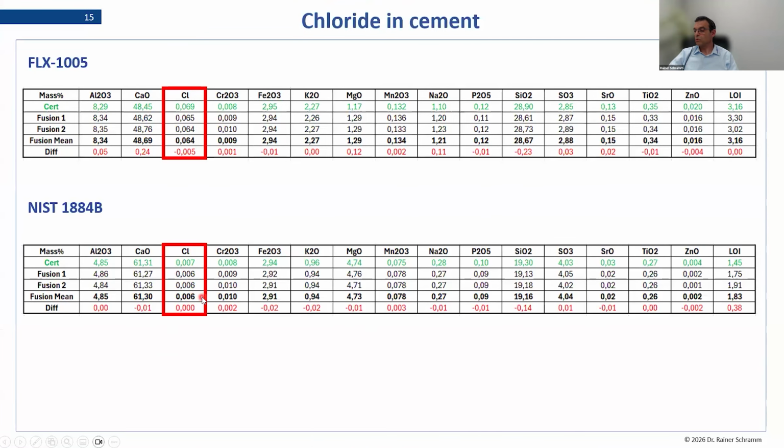And this is just what I said. Very constant temperature settings. The lid on the crucible guarantees you stable conditions inside the crucible, and in this way you can also run volatile elements. The most common are fluorine and chlorine, and of course also sulfates are for a certain degree volatile, but normally with stable temperature conditions, you always can do that very, very reproducible.